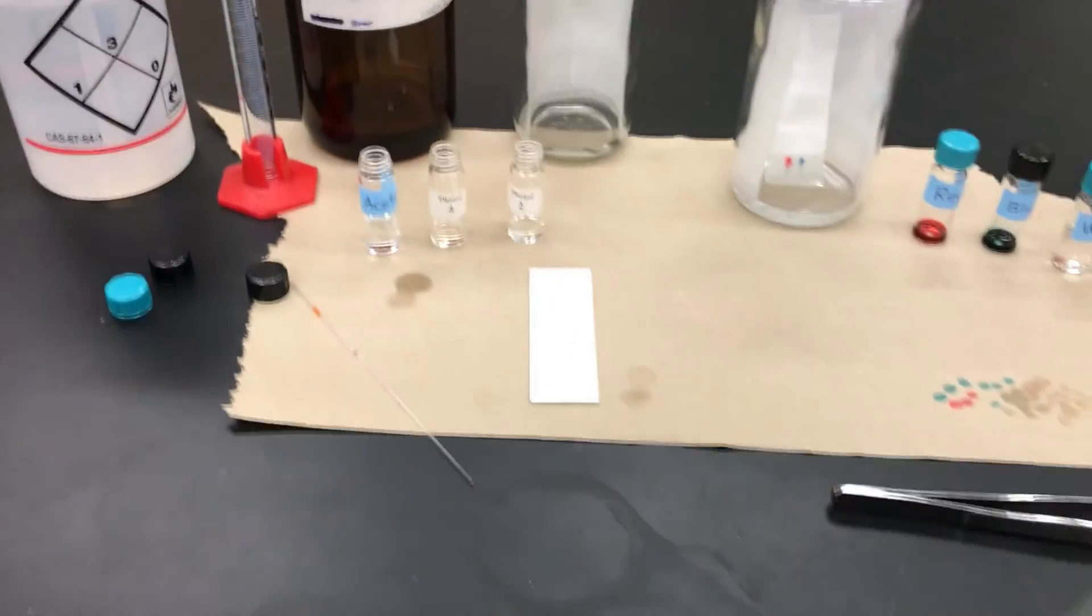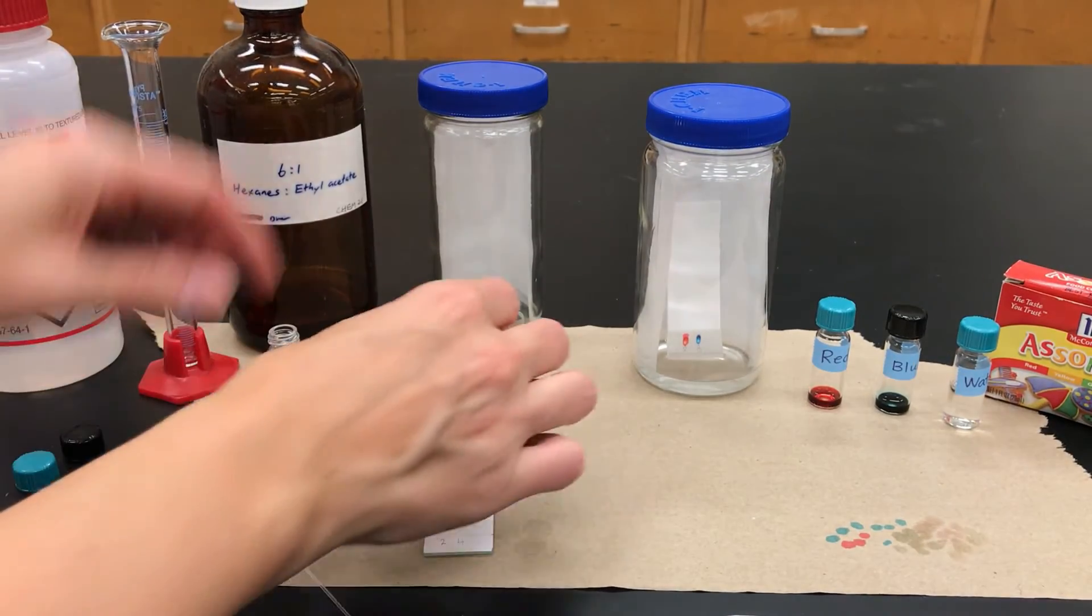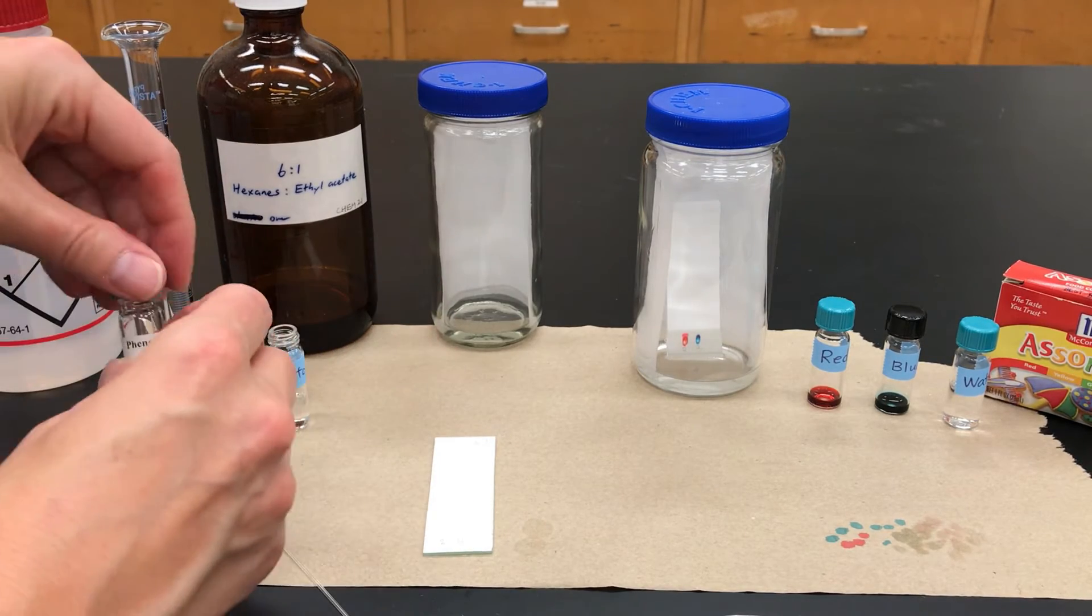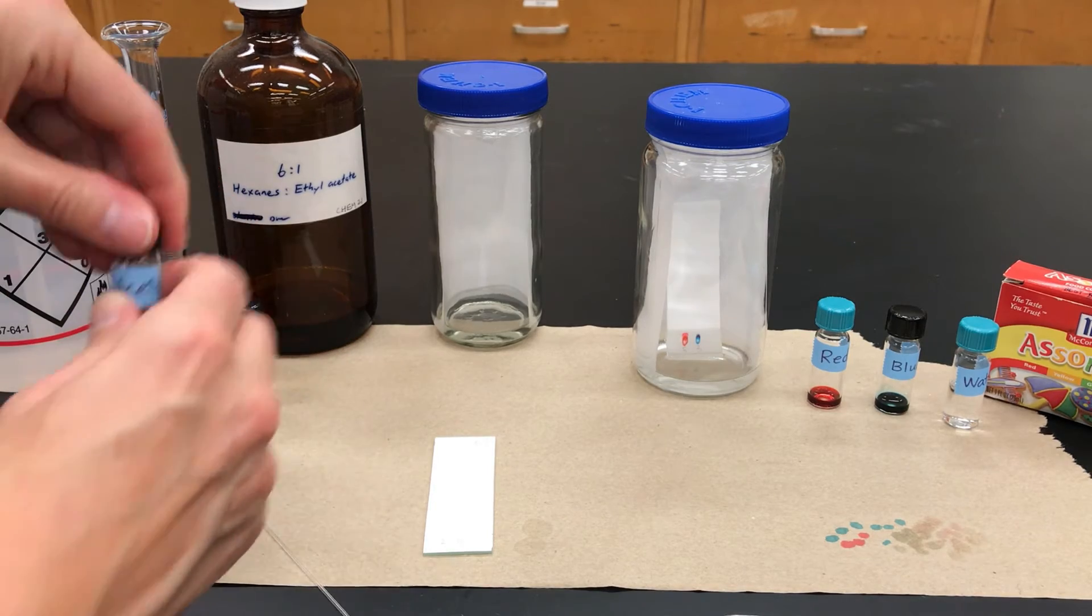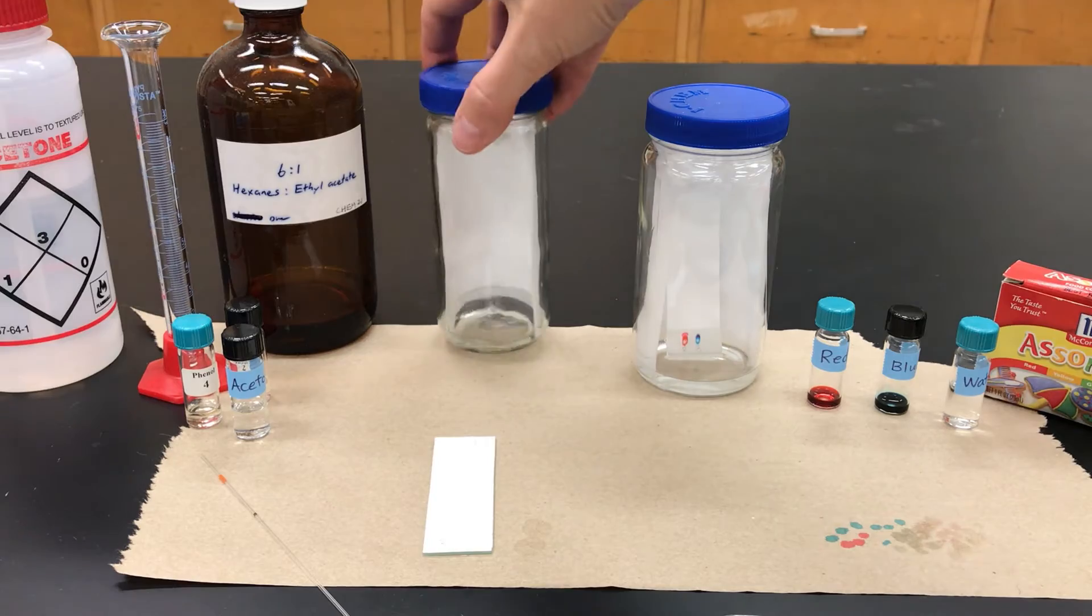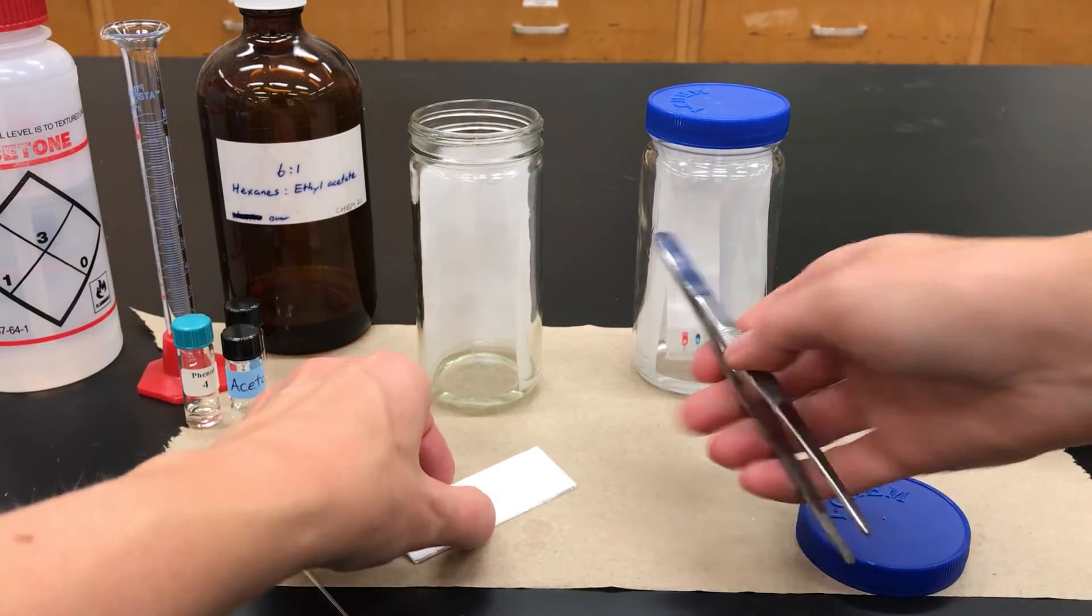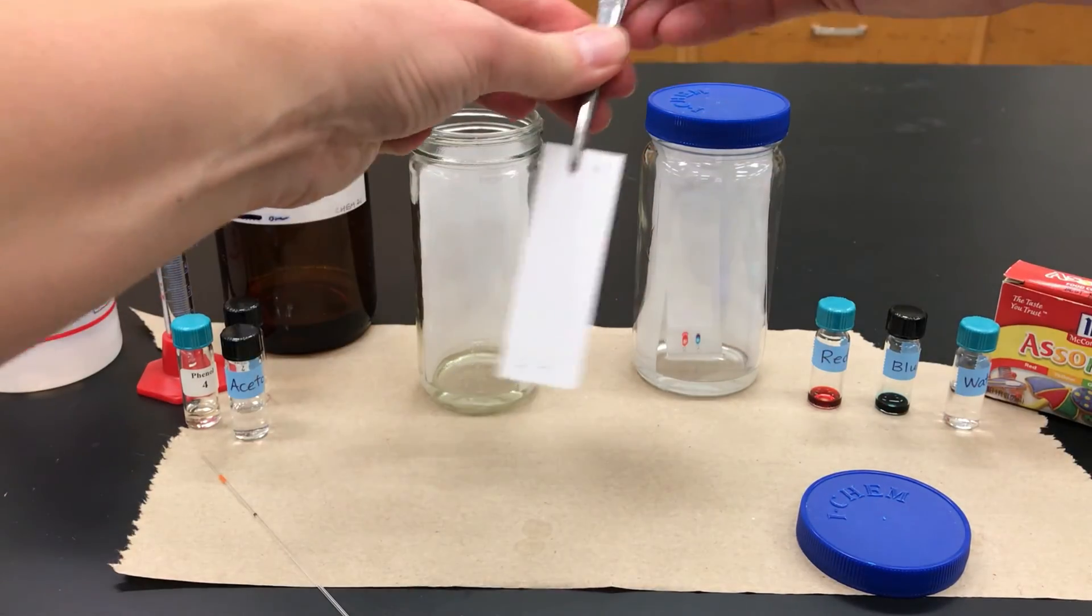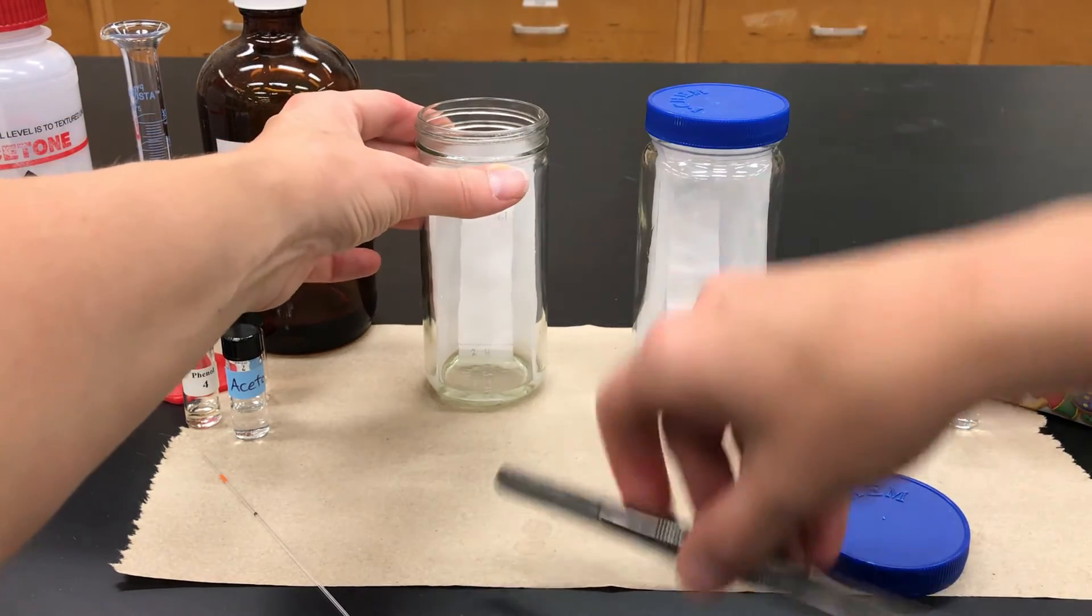And I rinsed with acetone. And I put on the lids so that I don't make a spill. And I'm going to do the same thing where I open up my TLC chamber. And I take my TLC plate that does have compounds on it even though you can't see it. And I put that in the chamber.